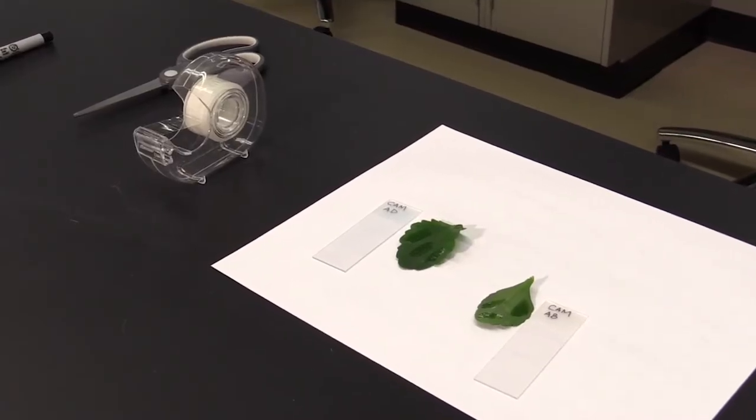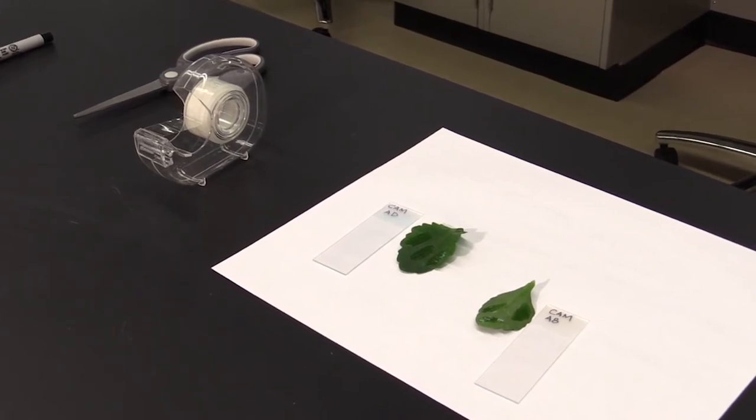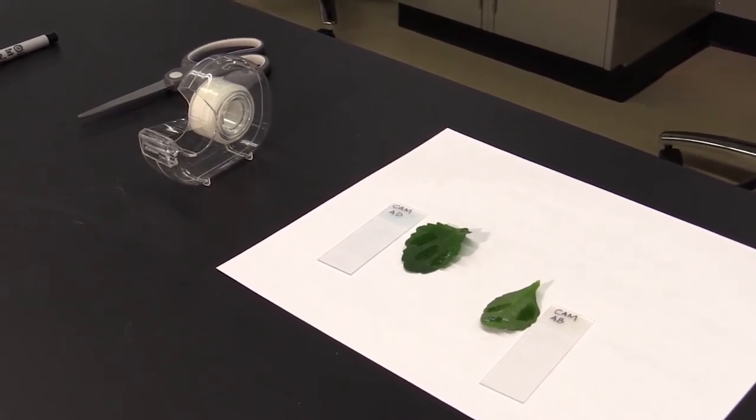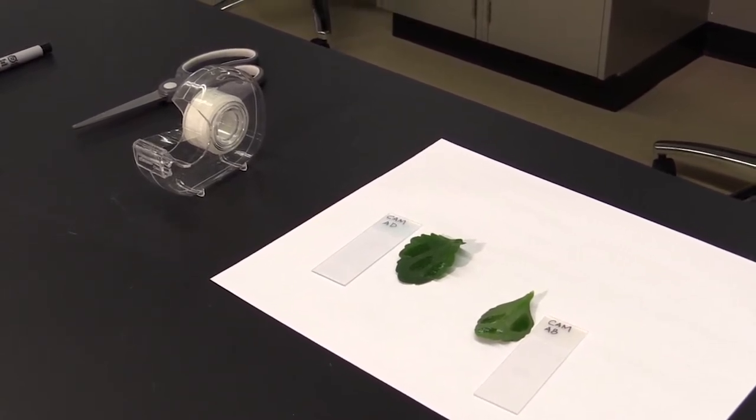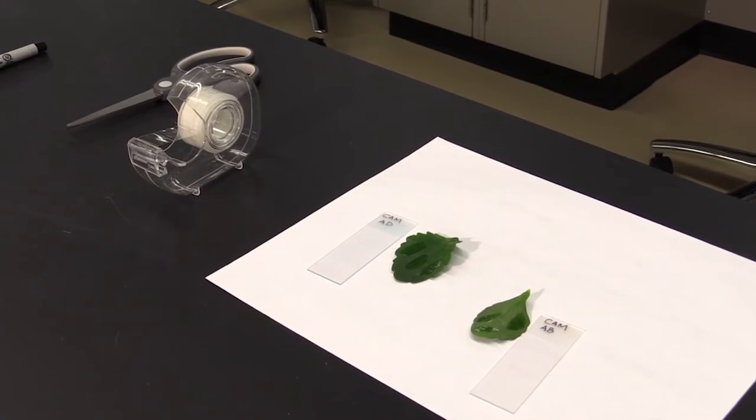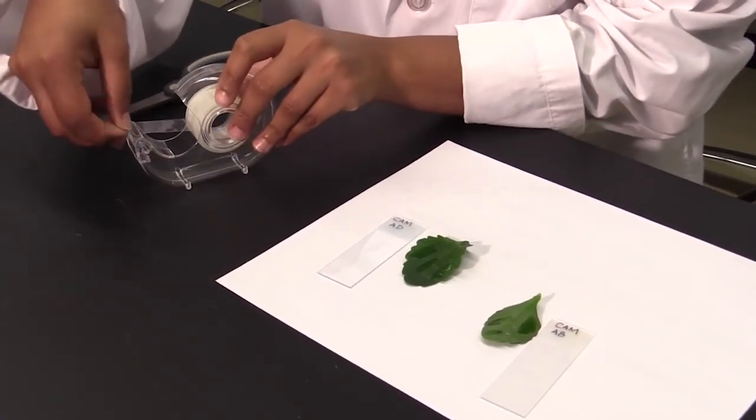For the next step in Part C, it is crucial that the three patches of nail polish that you applied both to the ab-axial and ad-axial leaf surfaces are completely dry. When the peel is dry, cut a small piece of tape with scissors.